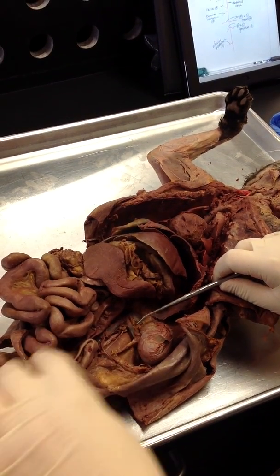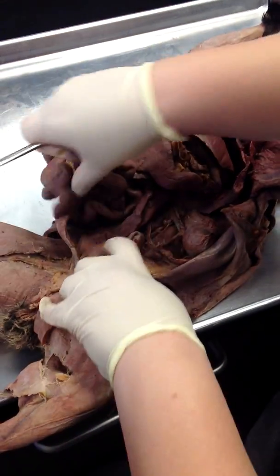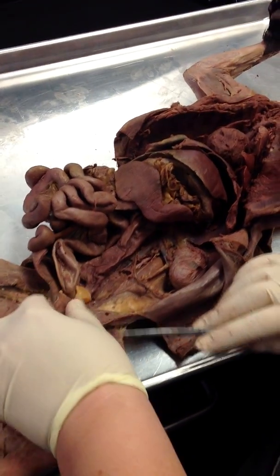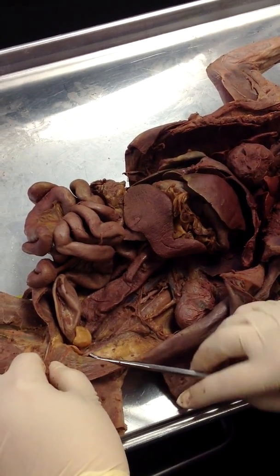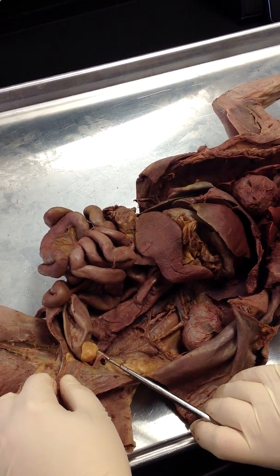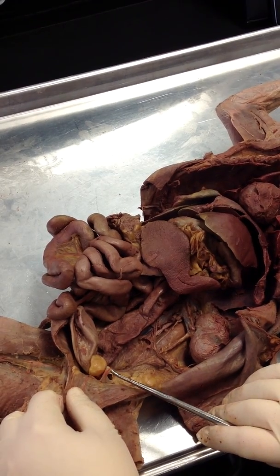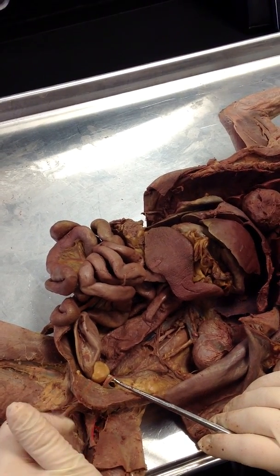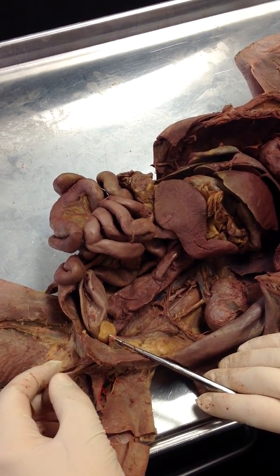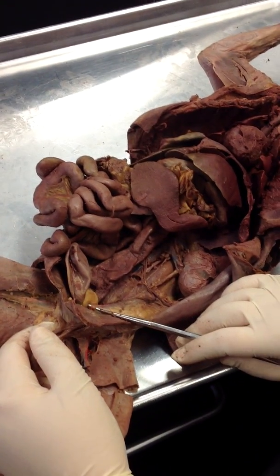And then the gonadal artery and vein, we can see if we pull on his testes, we can sort of see. Oh, look. Let me yank on this a little bit. So you see that little thing that wiggled right there? So that is the left gonadal artery, and the vein is there too. It's not as well injected. Gonadal or spermatic. You can say spermatic or leave it general and say gonadal. Sorry. I'm tired. Not doing well today.